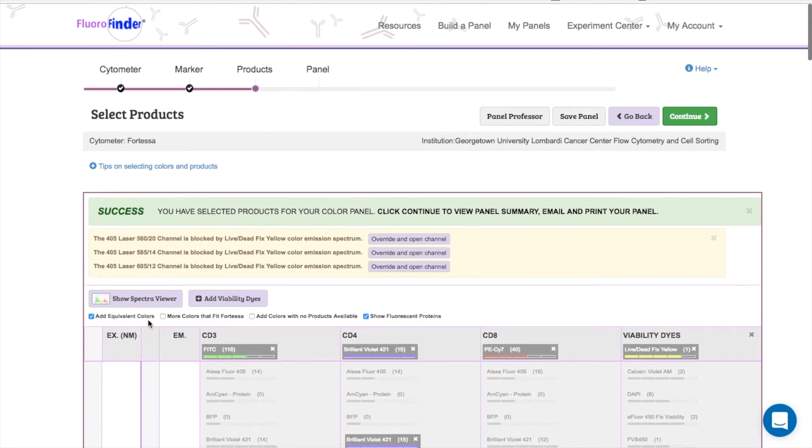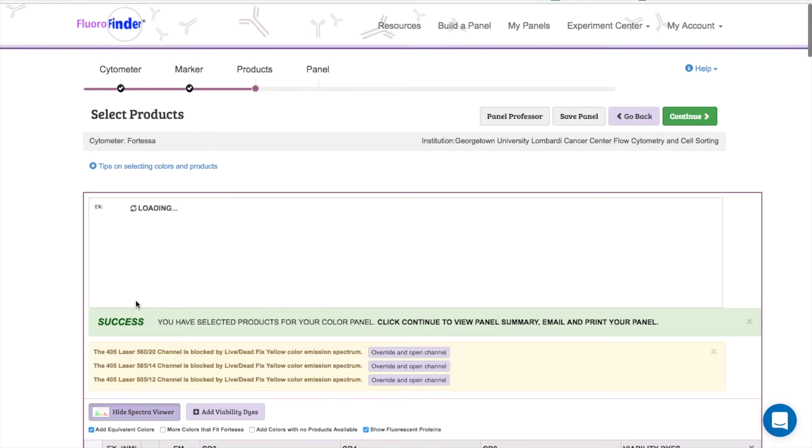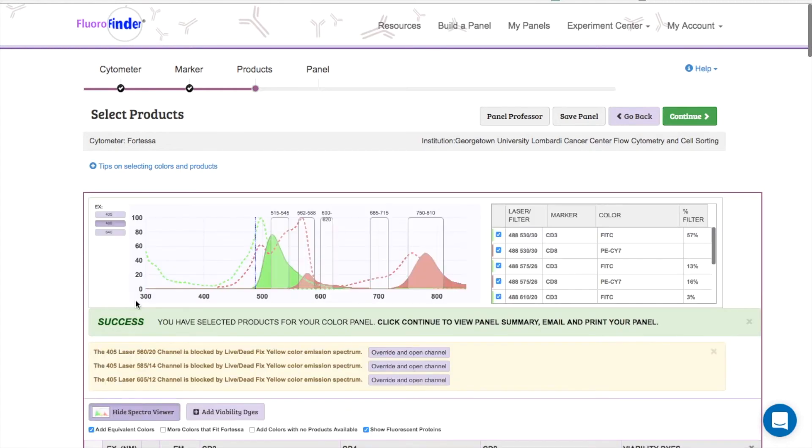Once you've selected all of your products and are ready to finalize your experiment, it's a good idea to check out the overlap on your spectral viewer.